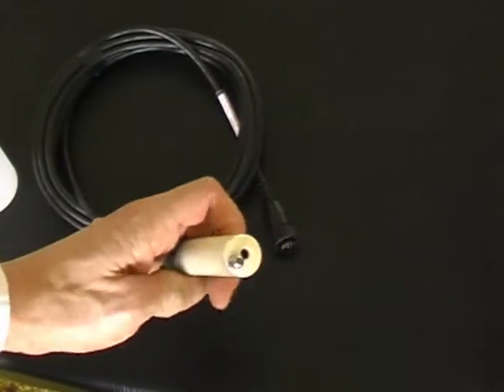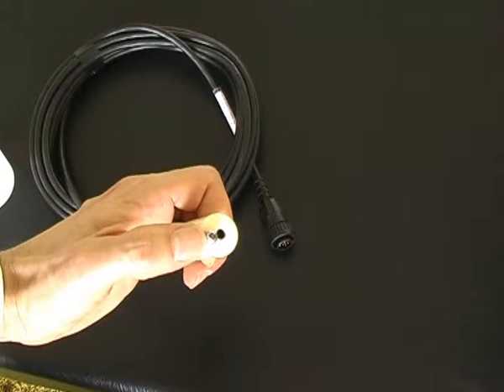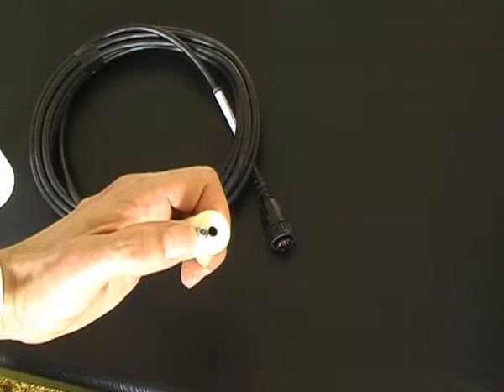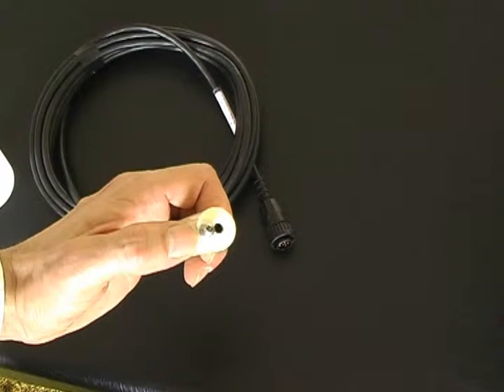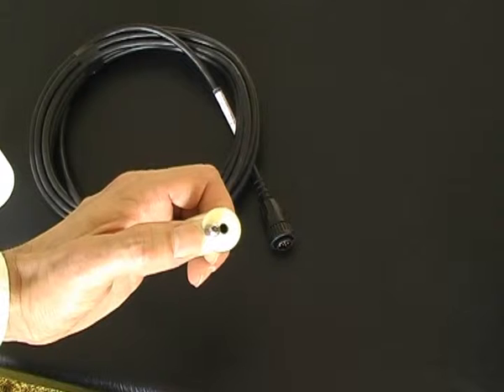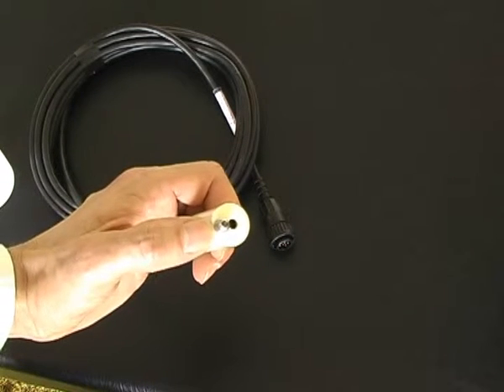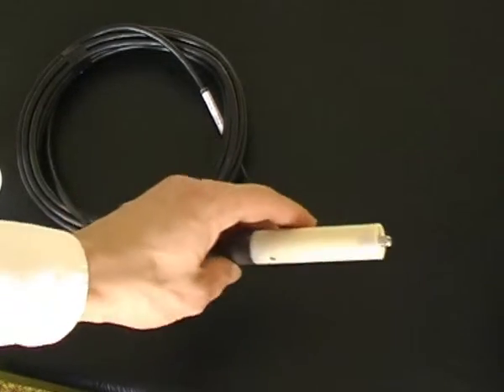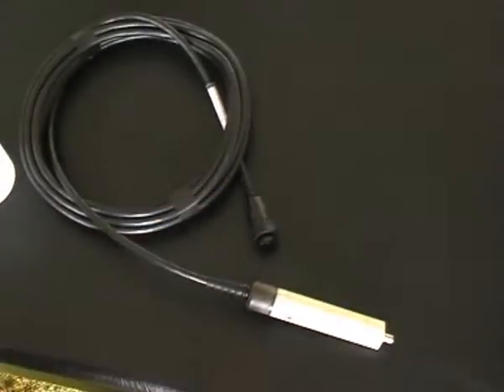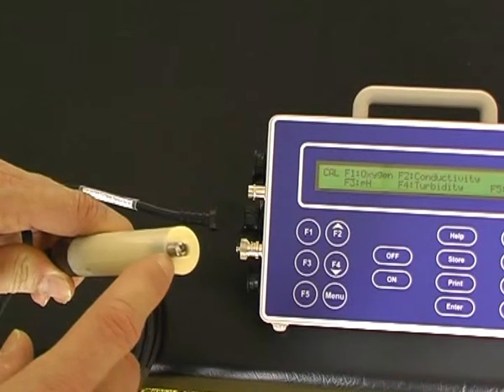Note that the conductivity sensor has an in-built temperature sensor — that stainless steel rod. It is not only temperature; it is also ATC, Automatic Temperature Correction, which corrects conductivity readings to 25 degrees Celsius. It must also be used for temperature correction of pH measurements as well. It is factory calibrated and only needs to be checked periodically, perhaps once a year.